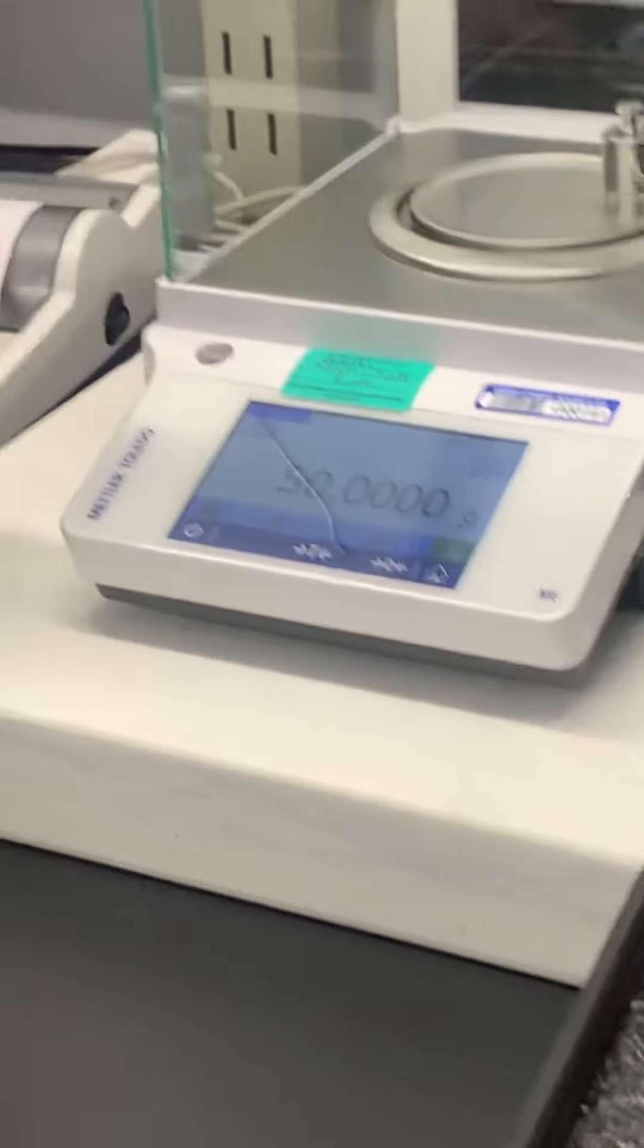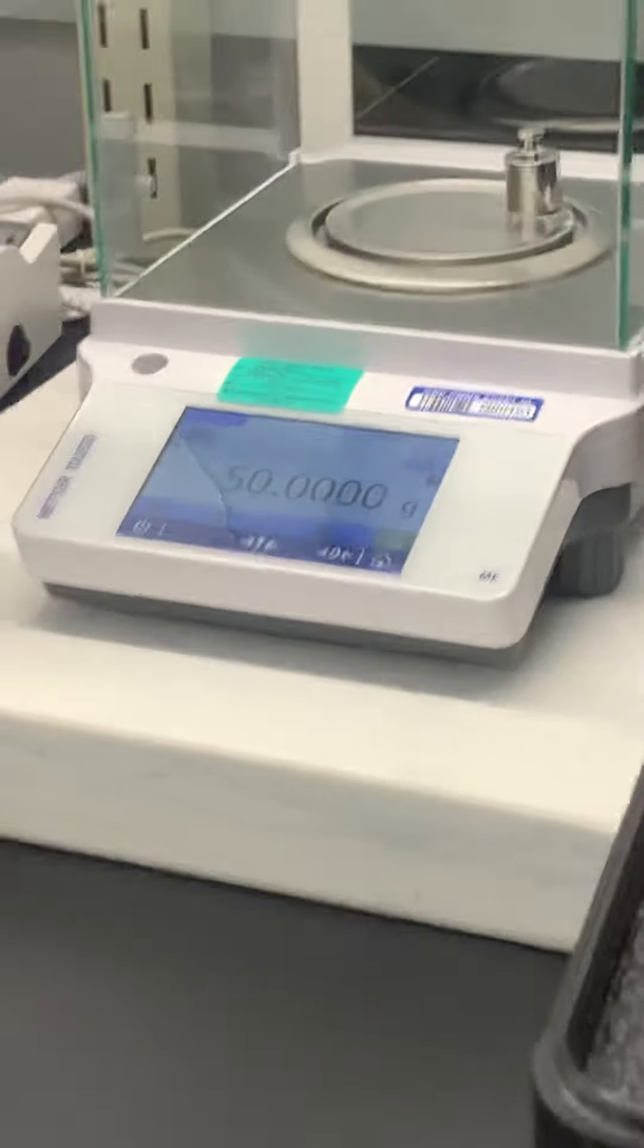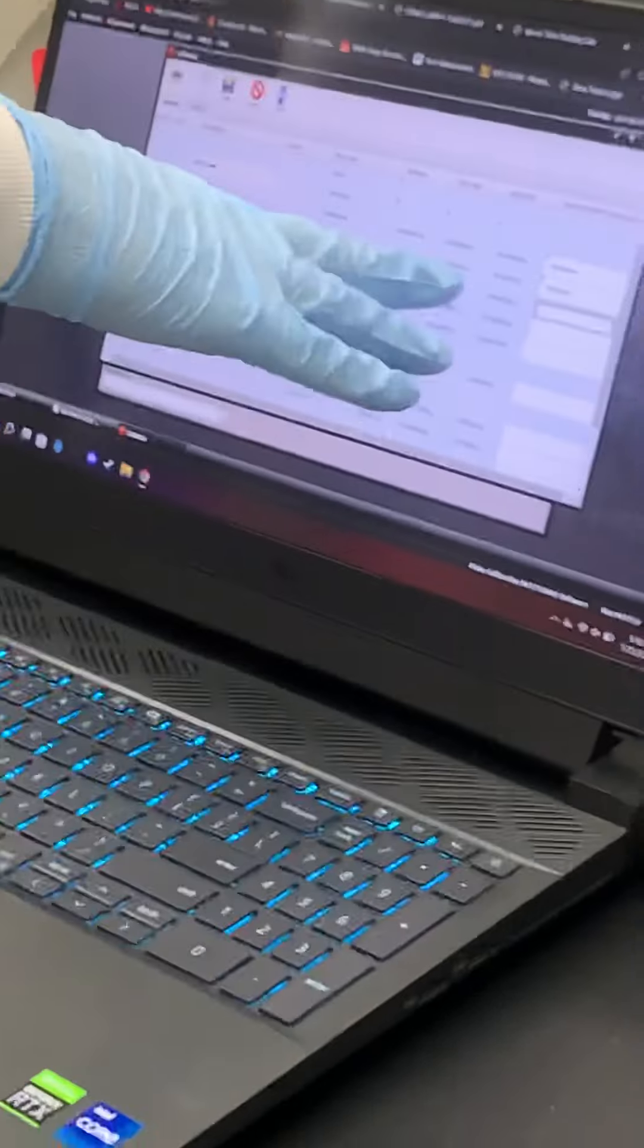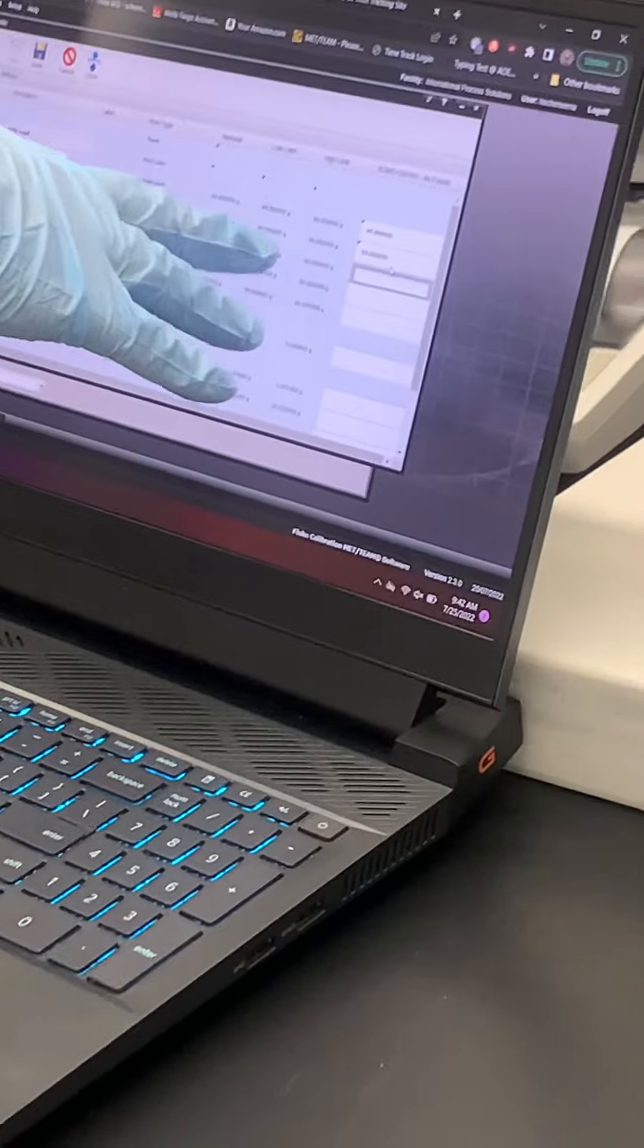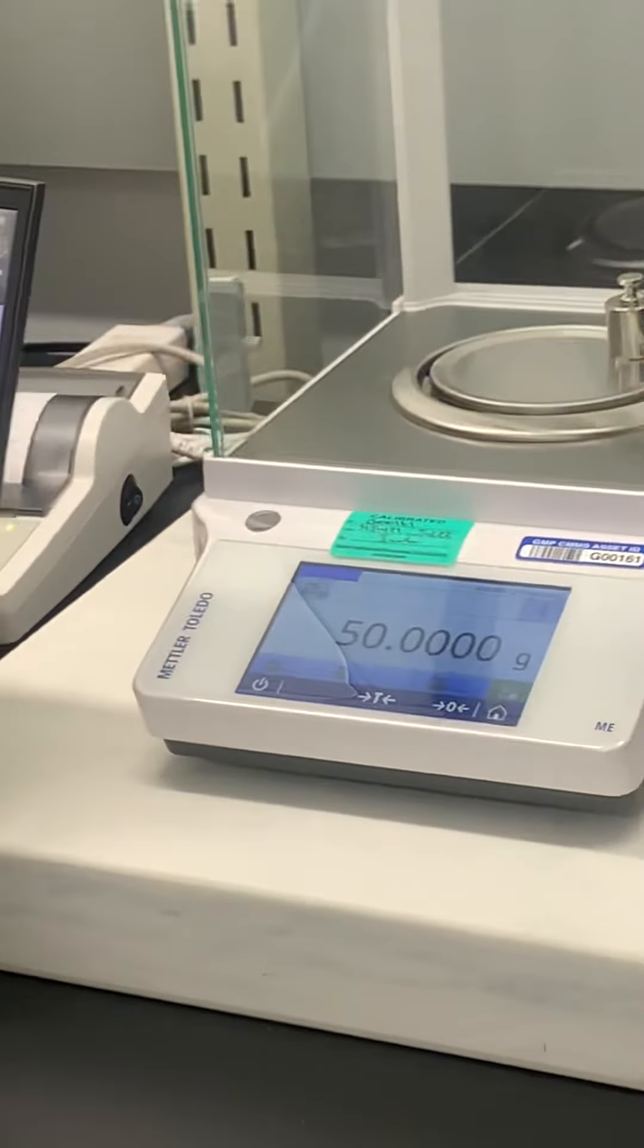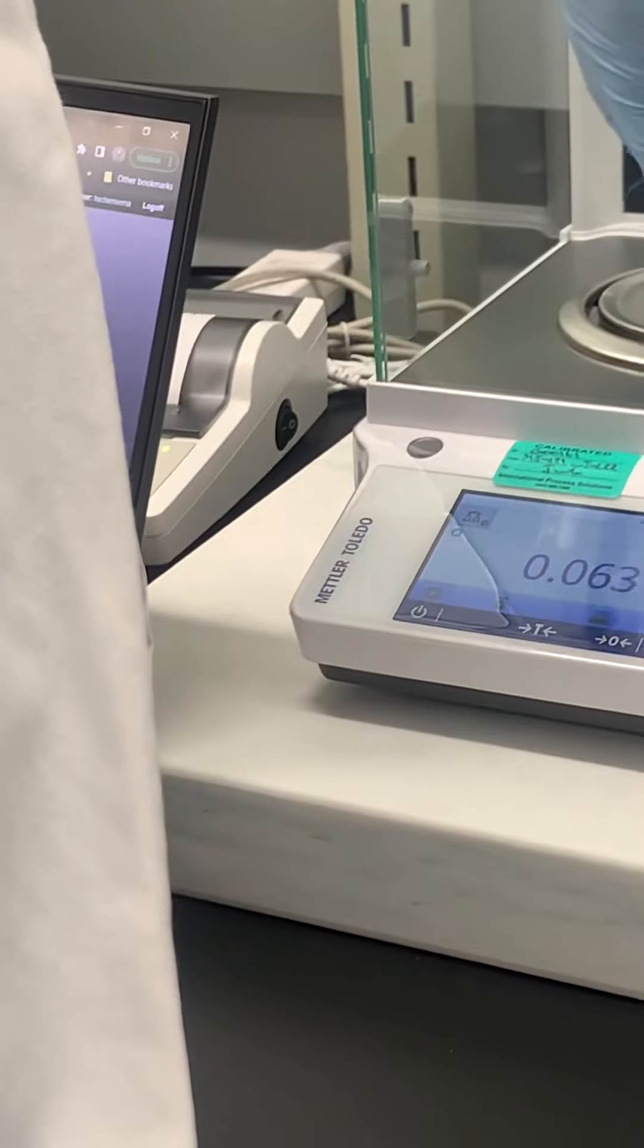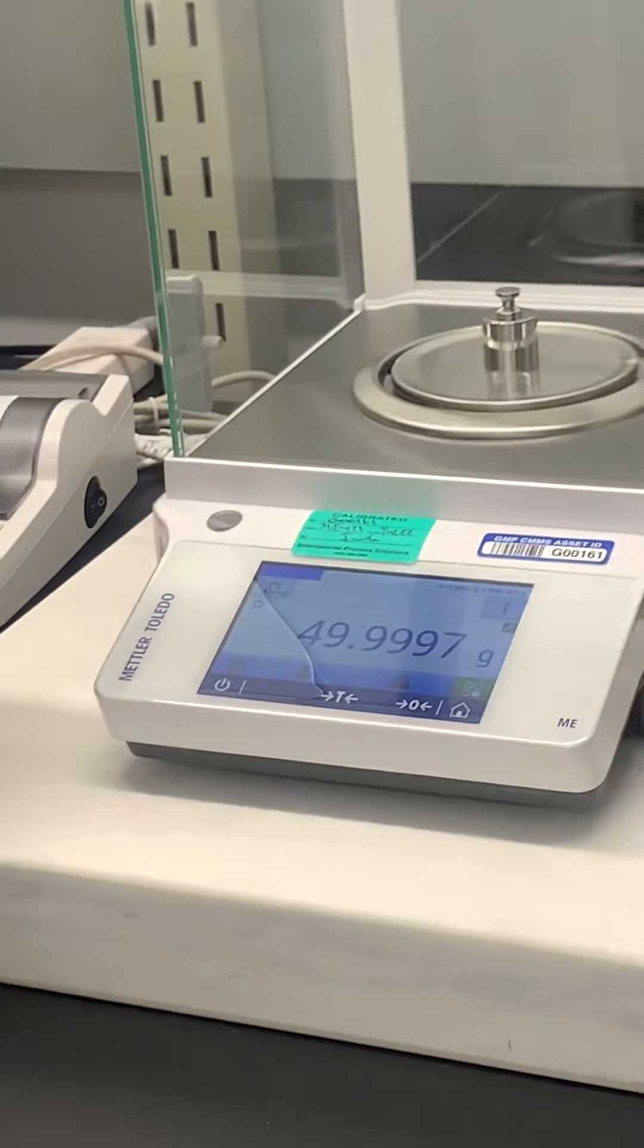So don't trust that? Basically, well I wouldn't trust anything. I'd always want to make sure that it's correct, because they give you your lower and your upper limit. It's like 0.05 grams.